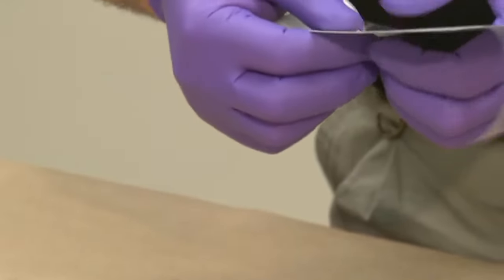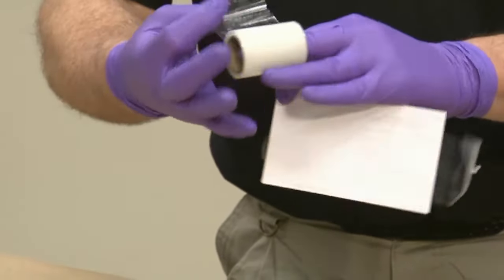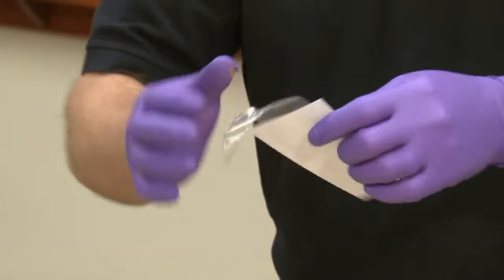Then just to make it nice and smooth, you can tear it right on the edge. Sometimes people will use scissors to go ahead and cut it. Just make sure you have a nice smooth surface on the edge.